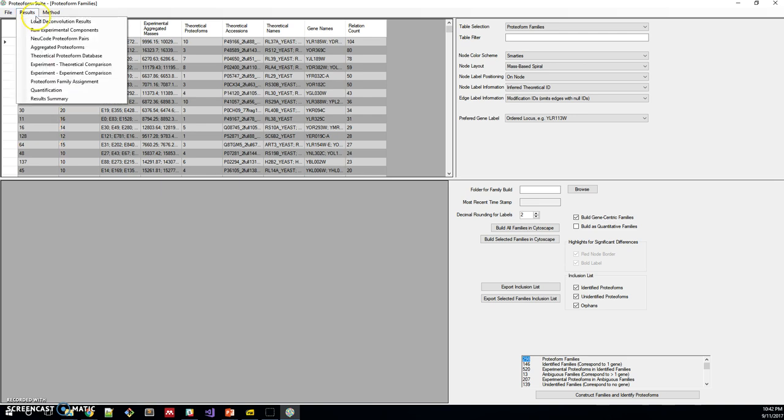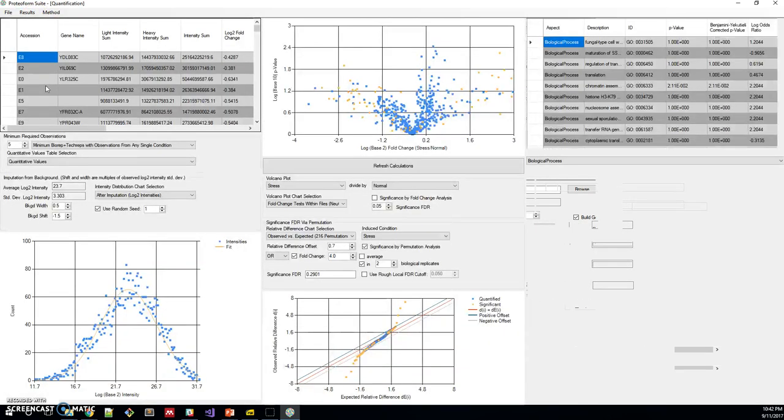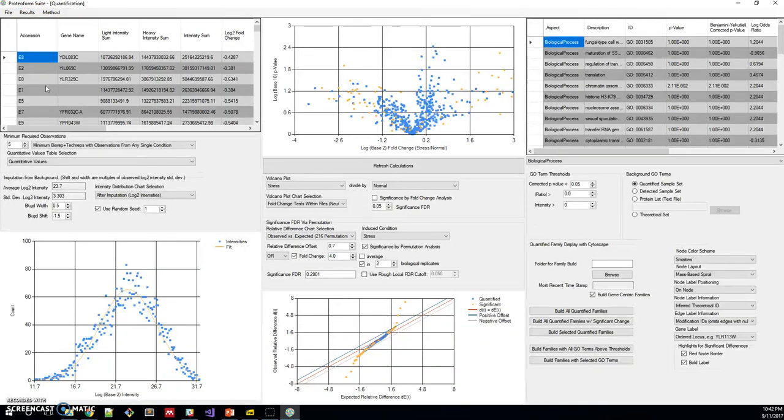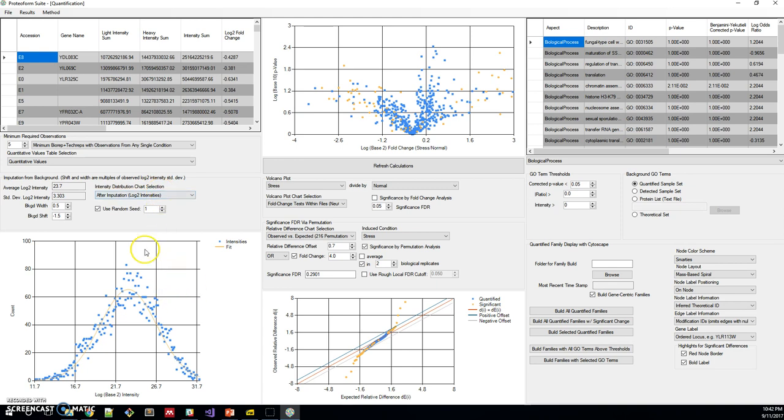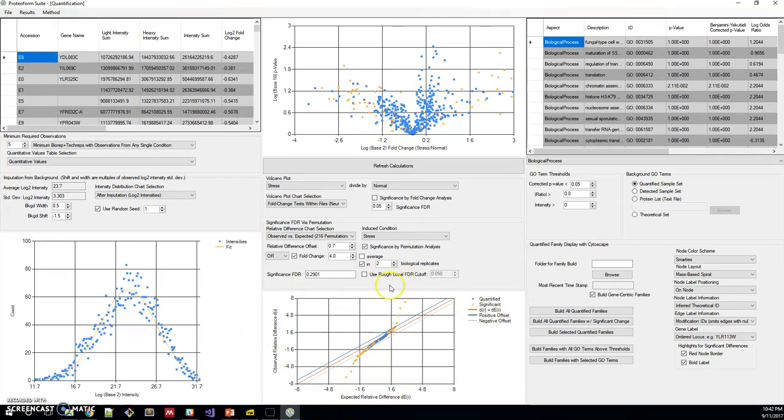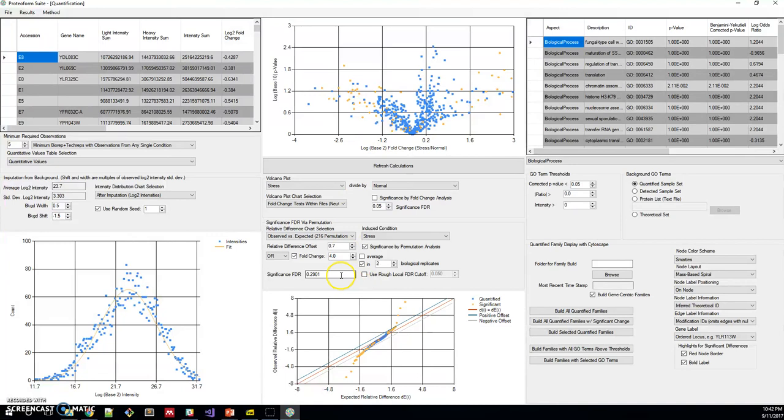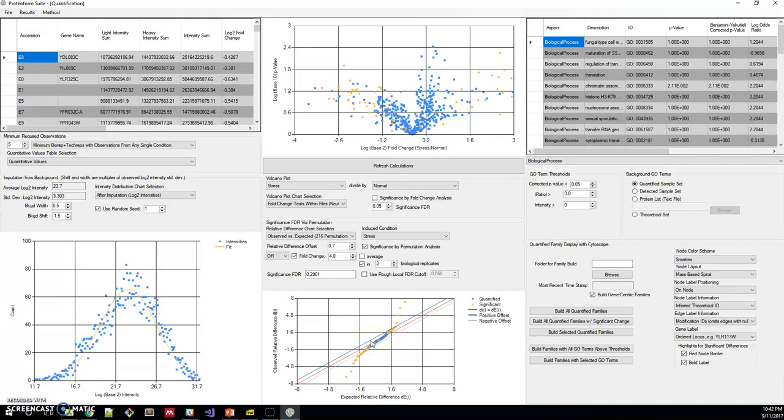Lastly, we use those proteoform families and the quantification results to do statistics and GO-term analysis. You can see here, this is the intensity distribution for quantified proteoforms. This is the permutation analysis result. Up here, we have log fold changes as well, where the yellow ones were significant, called by permutation analysis or by a fold change greater than four and at least two biological replicates. On the right here, we have GO-analysis.